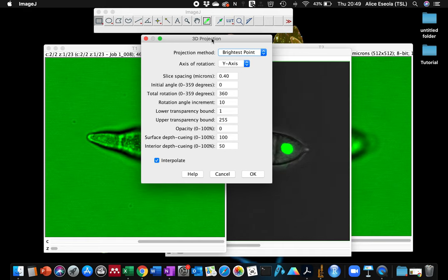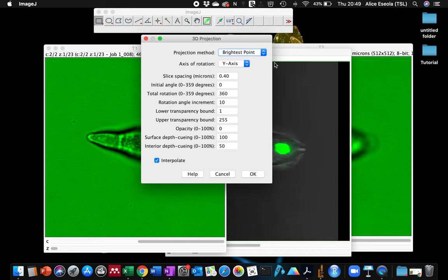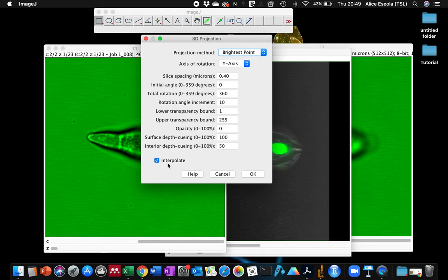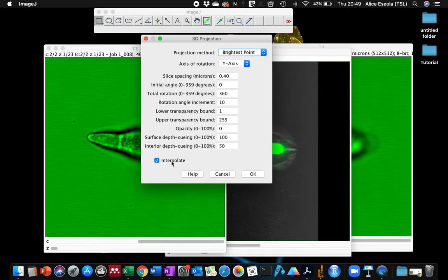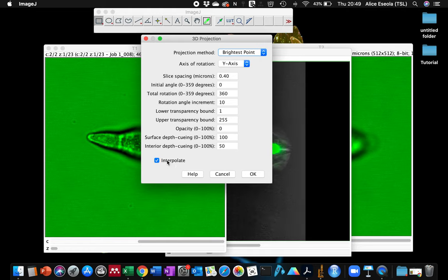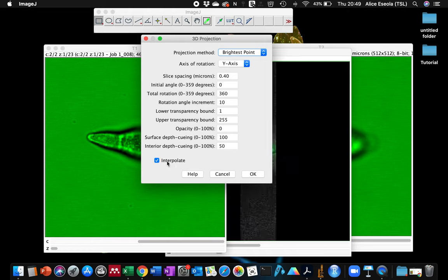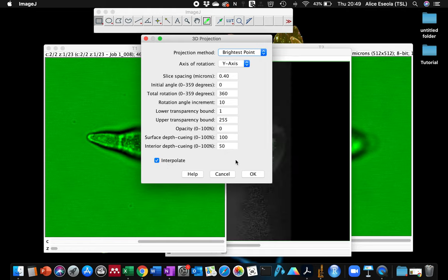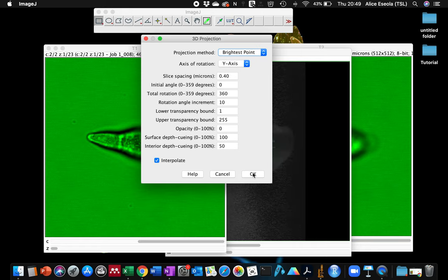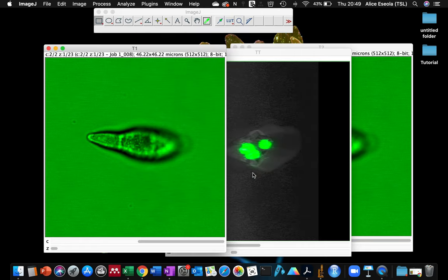I will show you the difference in what the view will look like when you use the interpolate and when you do not use interpolate. First let's do with interpolate and click OK.